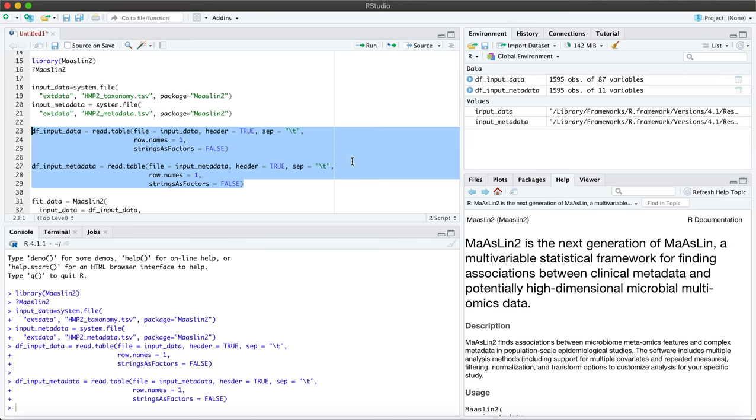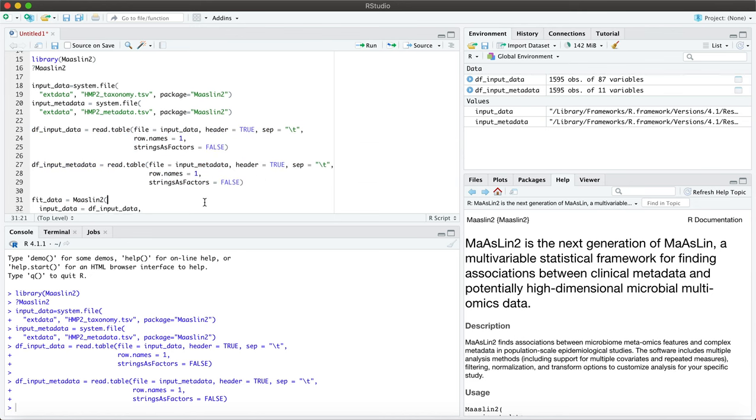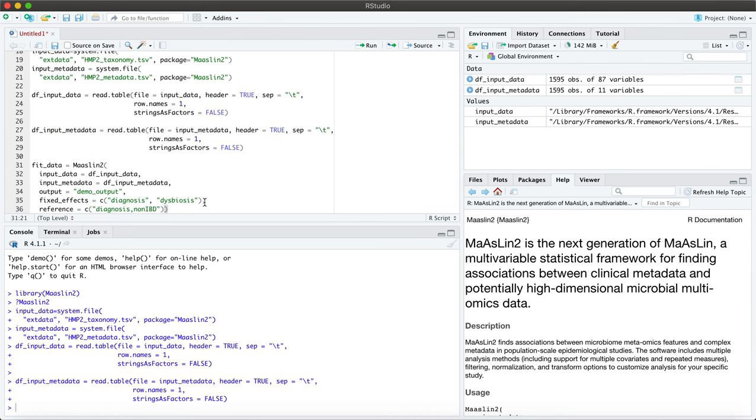Now within MaAsLin2 there are many parameter options for different data processing, from normalization to transformation and to the analysis method itself. So by default this package employs a TSS normalization from counts to relative abundances and a log transformation, and its analysis method is an LM or a linear model.